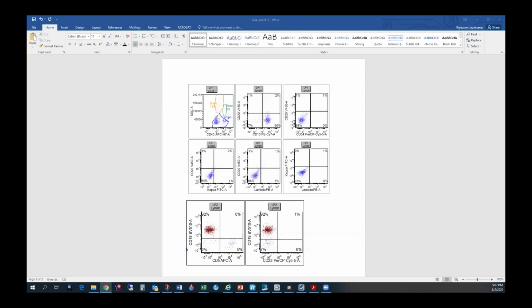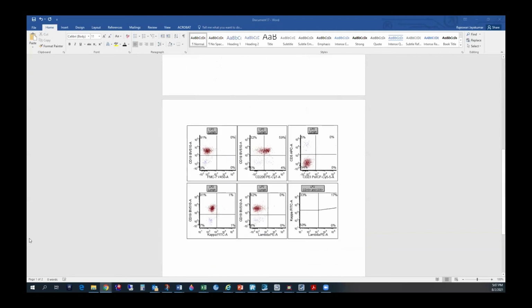I have a question. On the next page, the blast cells are showing CD200 positivity. Does that signify anything? No, blasts can be positive for CD200 normally also. Okay, B-ALL blasts can be positive for CD200. That's okay. And even AML blasts can have some CD200 expression.